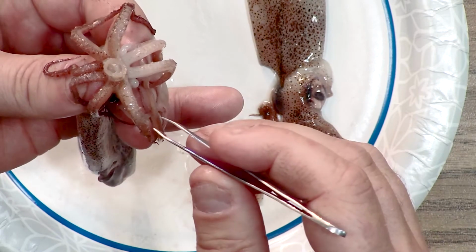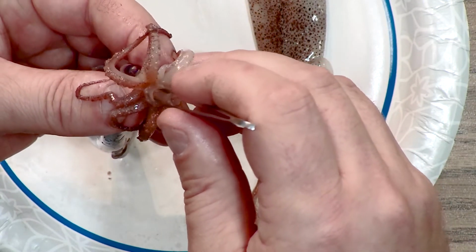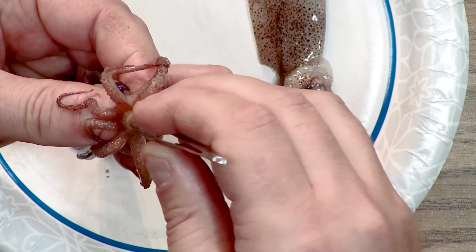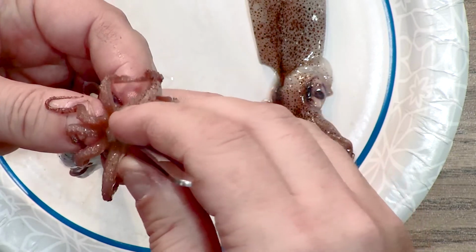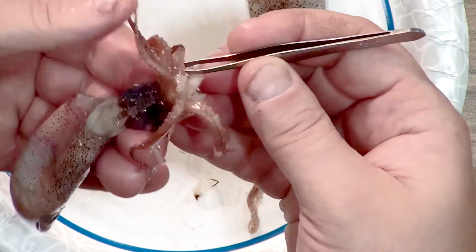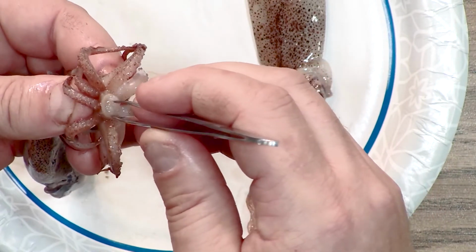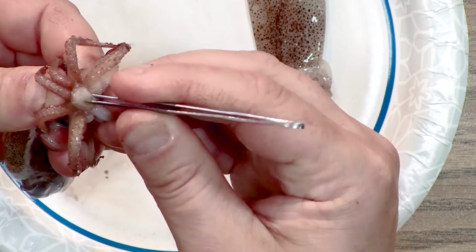And now that the black is gone, there's kind of a white bulbous shape in there. And I'm going to go ahead and push in there on both sides and see if I can grab this without tearing it. A technique that I use is on the side here, I'm pushing a little with my thumbs to expand out that mouth region and let that white object pop out.